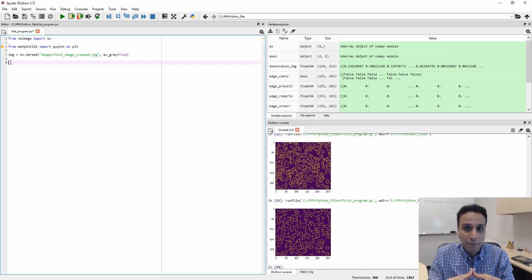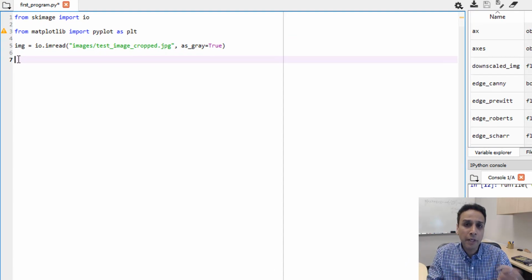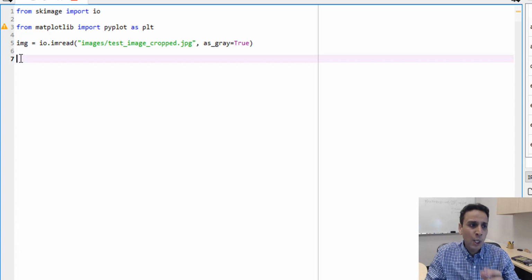Obviously, we're not going to do that. We are just going to assign a predefined point spread function and then look at the result. But the core point here is that deconvolution requires the original image and a point spread function, and it calculates the deconvolution. All it's doing is sharpening the image. For a light microscope, it makes absolute sense. It is available under a module called restoration.